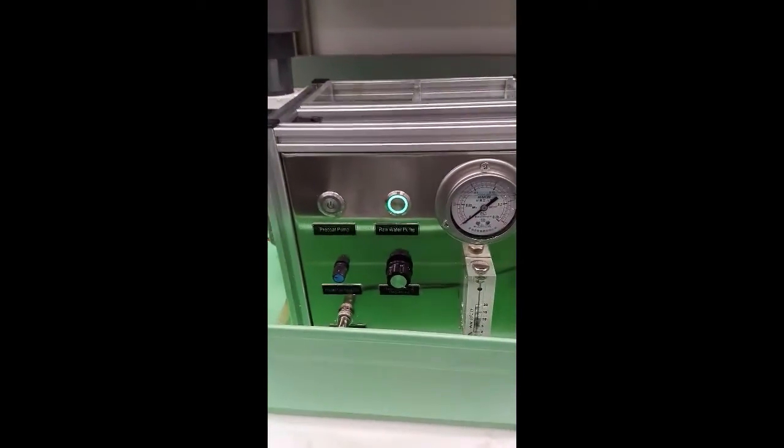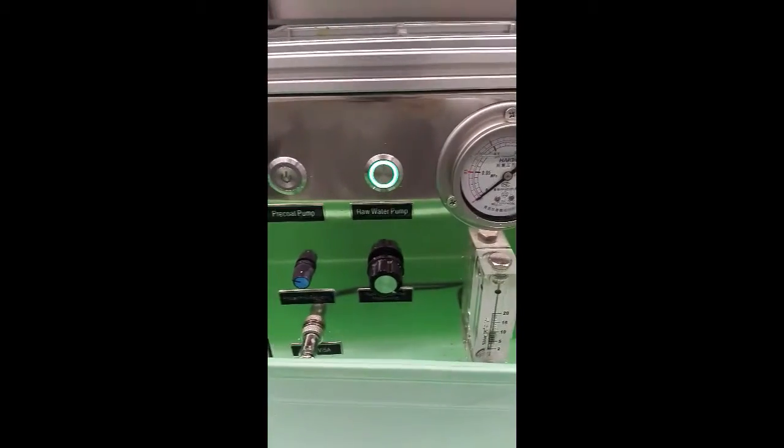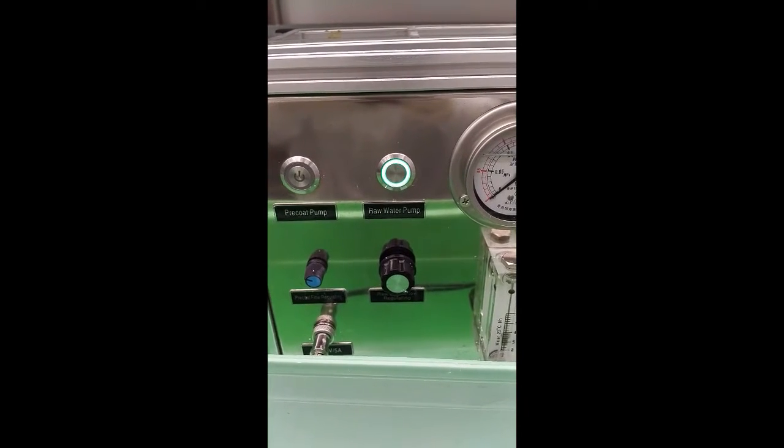We also have a pressure gauge, a rotameter for flow meter, and you can see that the pump for the raw water pump is on.